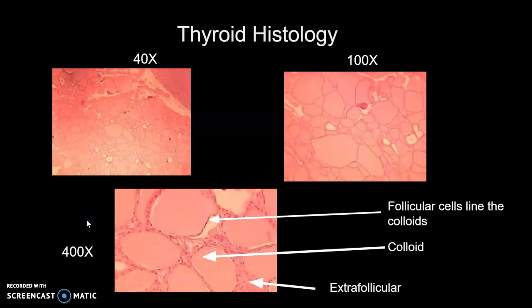All right. So here, let's look at the next gland, and that is the thyroid. So how do you recognize the thyroid gland? Simple. If you see these structures, which are nothing but follicles, that's how you recognize a thyroid gland. So whether it's a low magnification or a higher magnification, you should see follicles. Now, three things that you need to identify. Here, this is the colloid. Of course, I'll never ask you for the colloid. But definitely I'll ask you, what are these? Identify the cell.